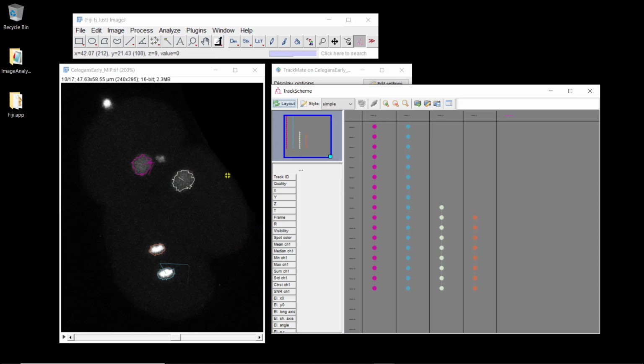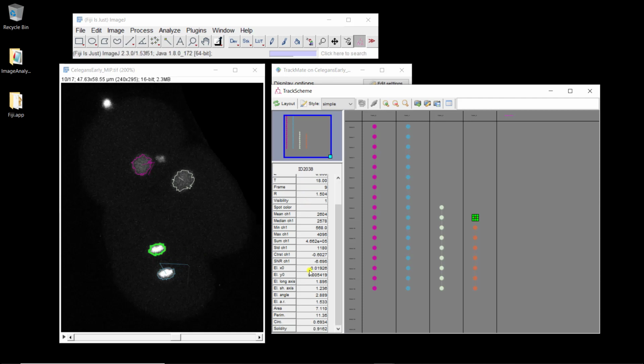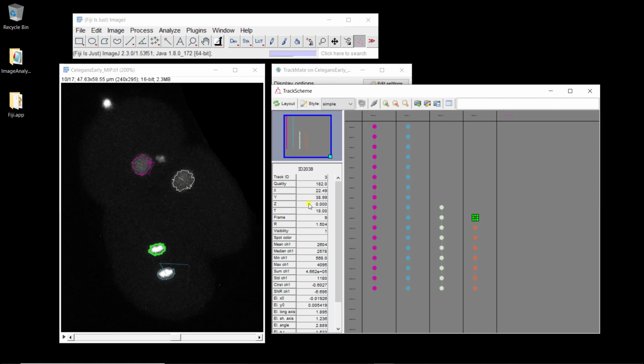So it's interactive. If I click on the first frame for the orange track, it shows me which spot corresponds to this one. I have all the features that are associated to this spot as well. And the good thing is that I know that if I go at the same time for the blue track, it corresponds to the other one, and if I go to the frame before, it's actually the mother cell. So here, what I want to do is to connect this spot to this one to show that this track actually starts from the beginning and then it divides into 2 cells.